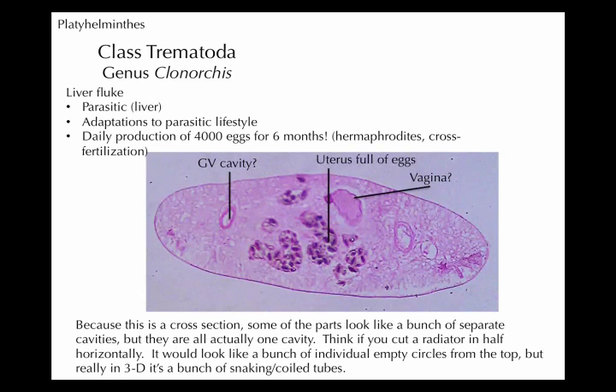4,000 eggs a day for up to six months. I also wanted to point out that on some slides it looks like a hole — like a vesicle or something — but really it's a tube. If you cut a tube and look down on the top of it, it looks like an empty ring, but it's really a tube — you just took a cross-section. That's why this is not all one sac. The uterus has a structure to it, and when you cut it you only see parts of that structure.